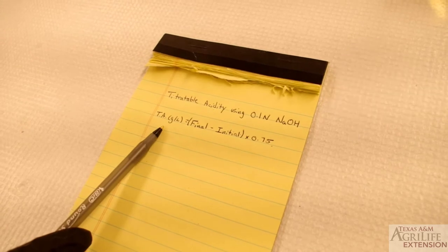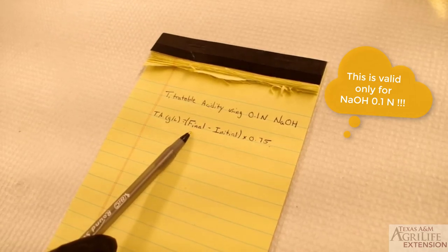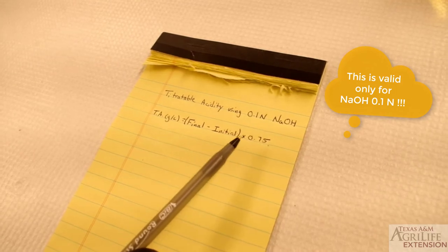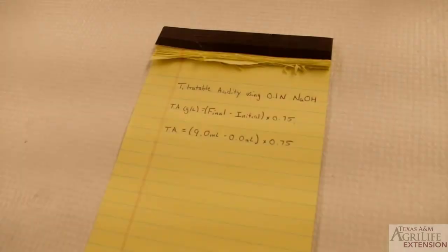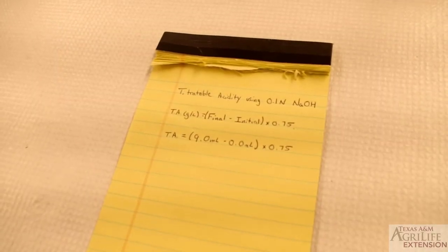We will use the following formula. Titratable acidity, grams per liter, equals final volume of sodium hydroxide used minus initial volume of sodium hydroxide, multiplied by 0.75. Plugging in our numbers, we have 9 milliliters final volume of sodium hydroxide used for titration minus 0, the starting volume, times 0.75.